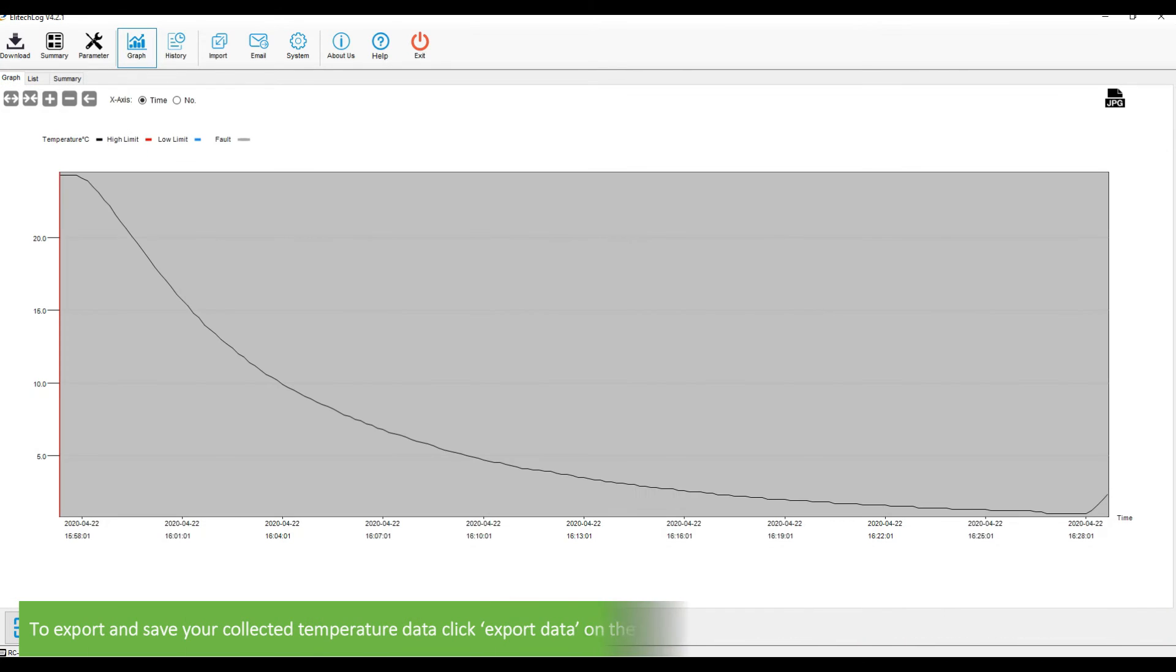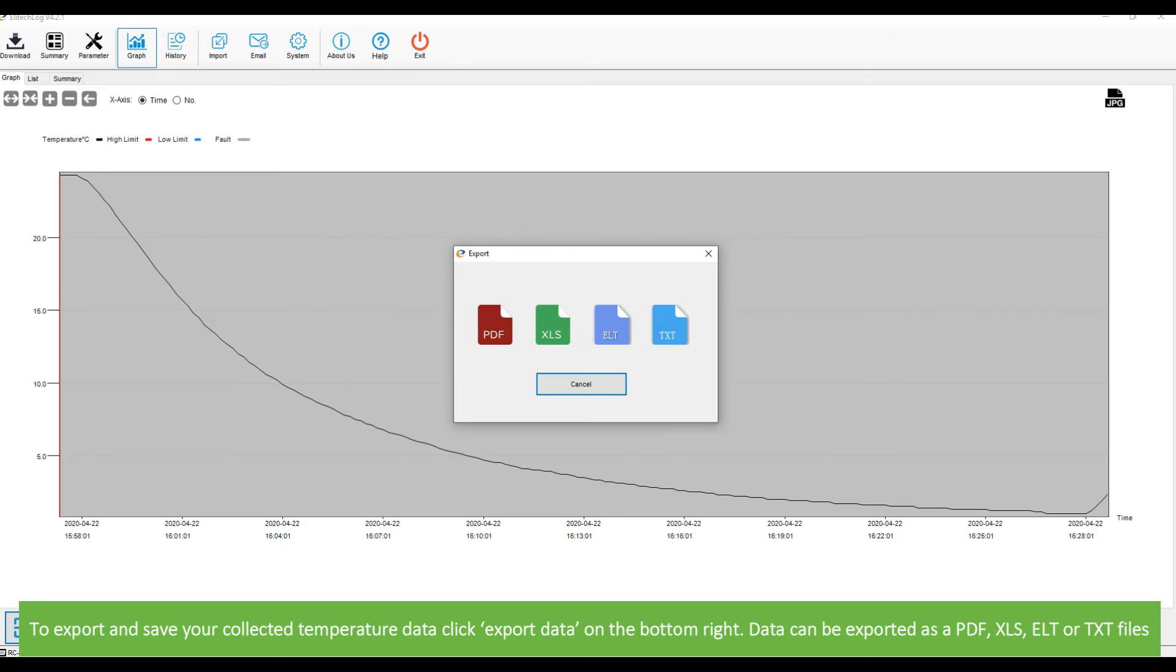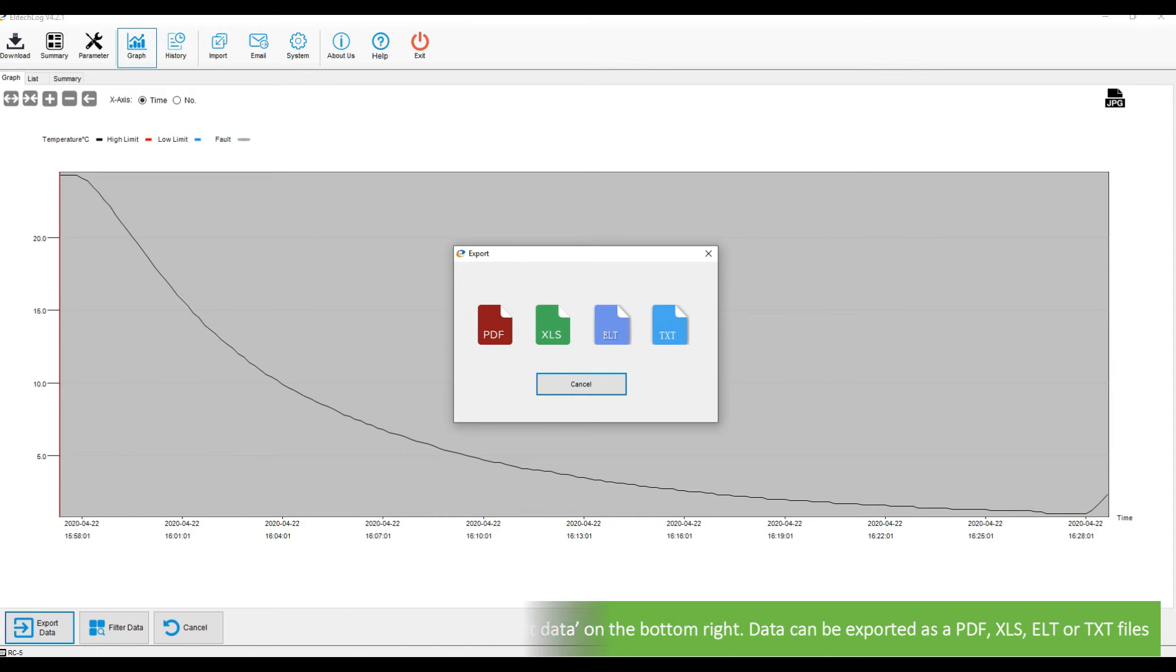To export and save your collected data, click export data on the bottom right. Data can be exported as PDF, XLS, ELT, or TXT files.